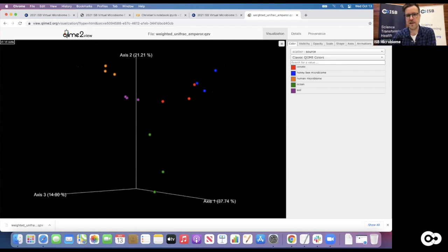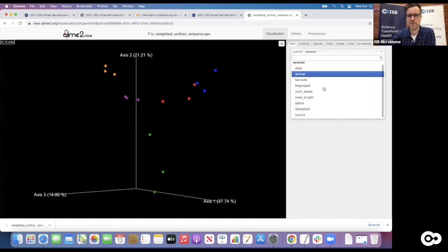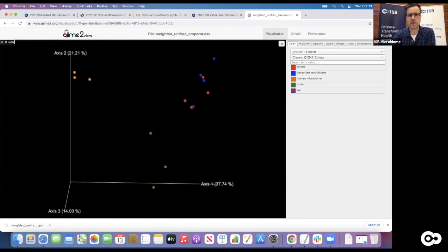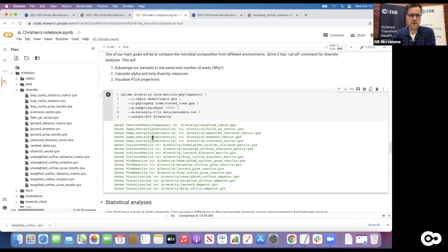That's already some insight - intuitively it might seem incorrect: why should one gut microbiome from one animal be that much different from another? But they have fairly different lifestyles and diets. The honeybee gut microbiome is a very controlled microbiome, usually containing just a few species. So there's quite some variation here. Ocean and the human gut microbiome are kind of outliers - fairly different from every other sample. That's the beta diversity visualization, and it gives us some useful information.